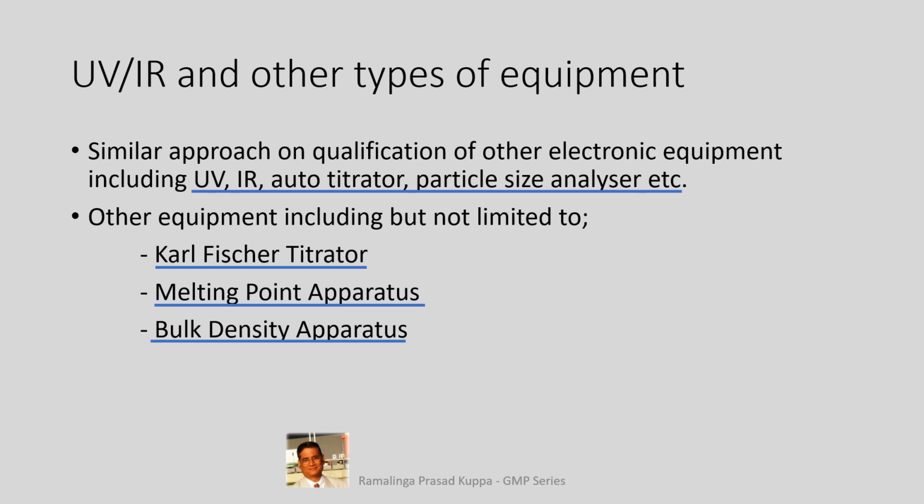It should be a qualified cylinder. Usage of 1 mm mesh is also a specific requirement for the test. All these items have to be qualified to carry out the bulk density test accurately and scientifically.